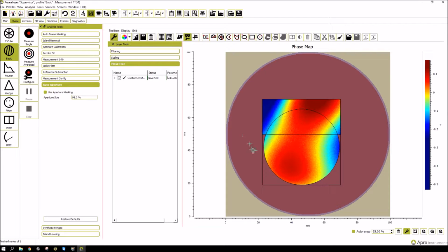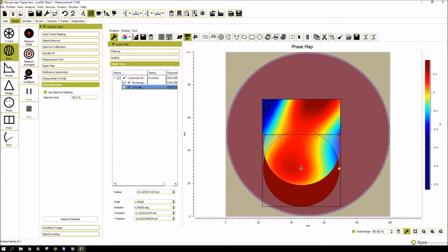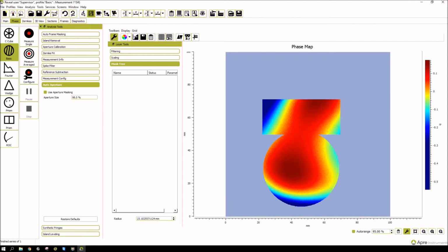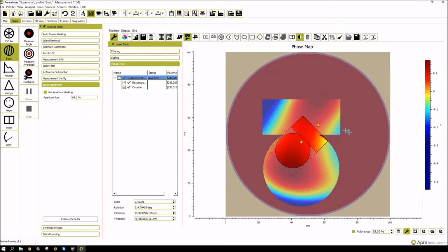So reopen it. Now you can also click on each individual mask within this sum, as shown here on the mask tree. We're only getting one or the other, and that allows us to reposition it without taking those two apart. So I'm just going to move this down. And we're going to close the mask editor, and now it's this new shape, but it's still combined. As you can see, it's still the same group. And if I select the sum, which is an inverted sum, I can then grab it and manipulate it as a group.